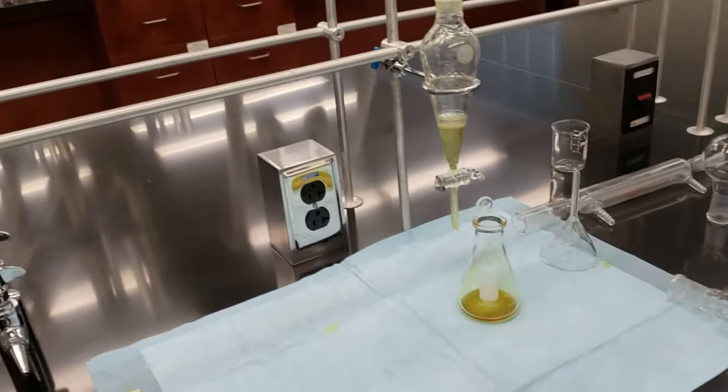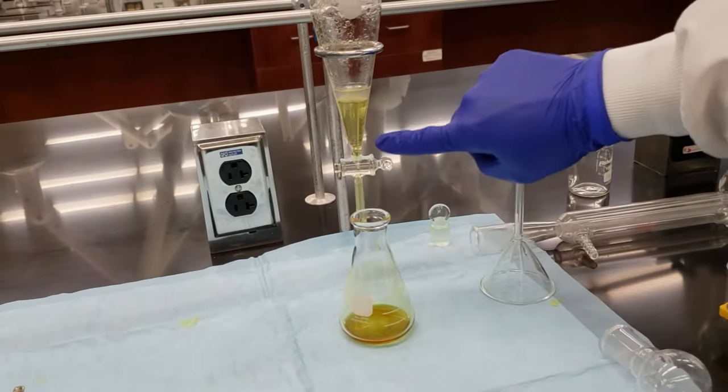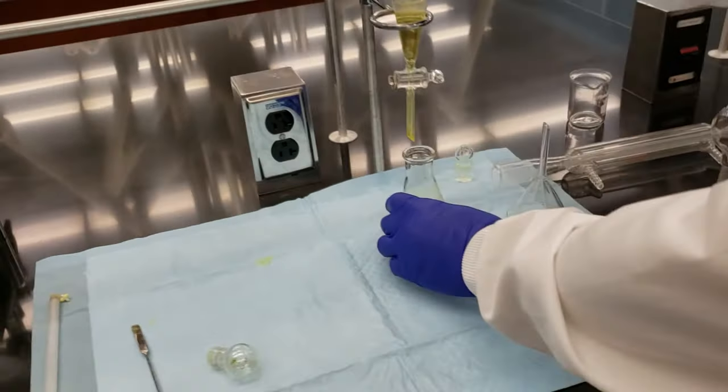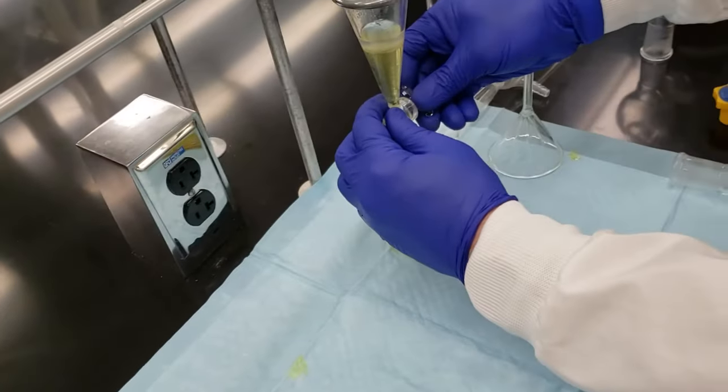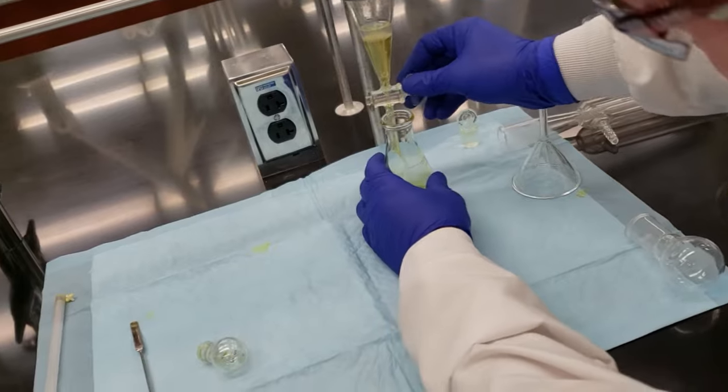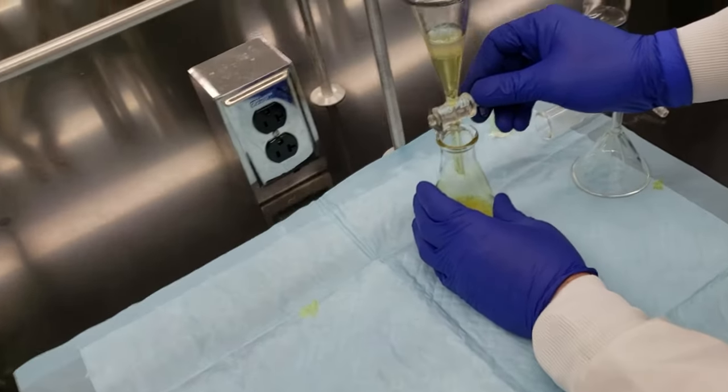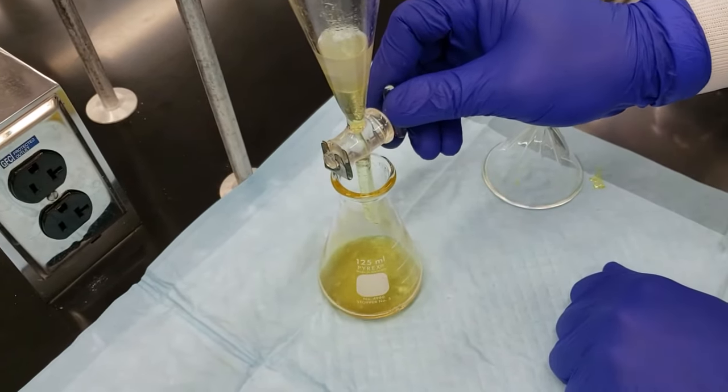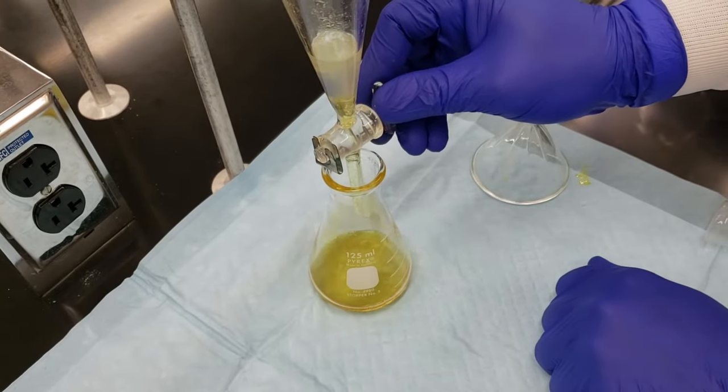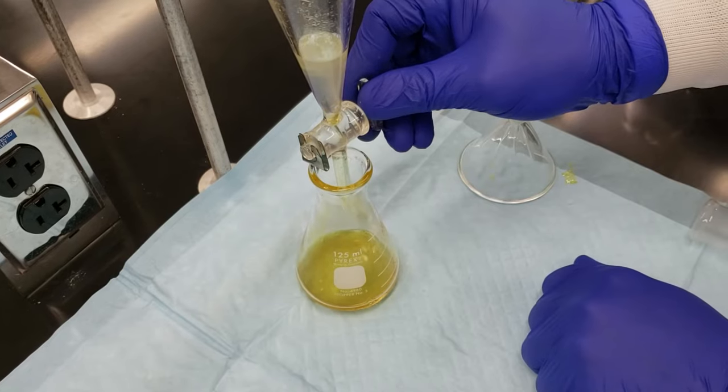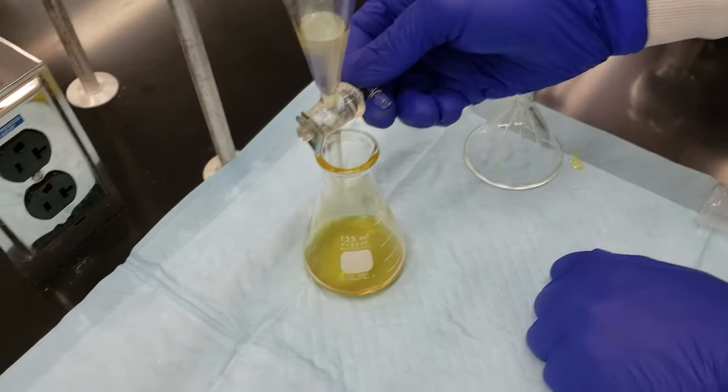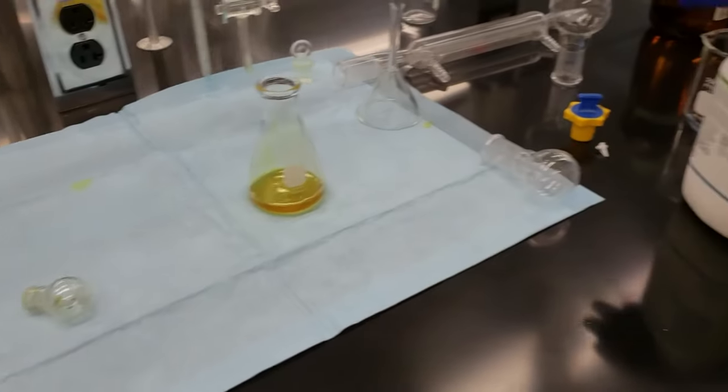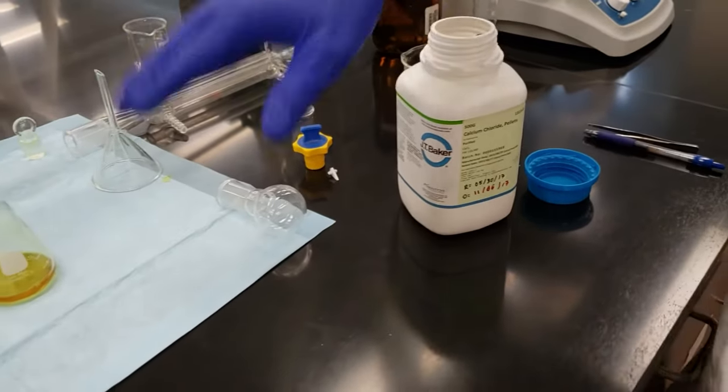So our layer has separated. We can see our yellow colored bottom layer, which is our methylene chloride. We're going to go ahead and drain that off into our 125 milliliter Erlenmeyer flask. Make sure we get right at the interface. We might get a little bit of the water. We want to make sure we get all of our product in our methylene chloride layer. If we do get a little bit of water, that's fine. We're going to go through a drying phase right now. We're going to use calcium chloride to dry this methylene chloride layer.